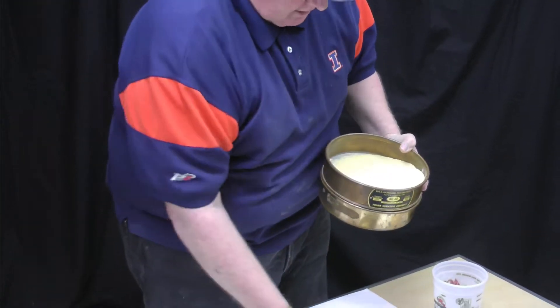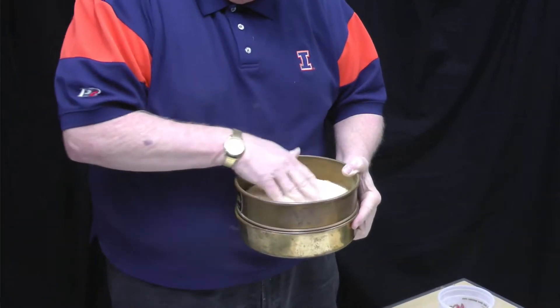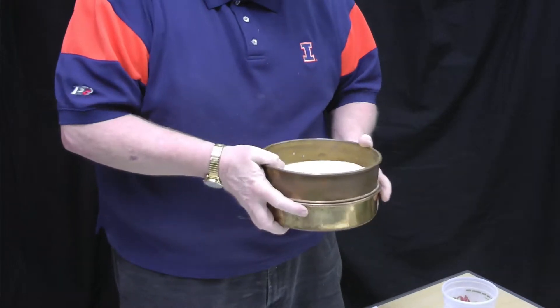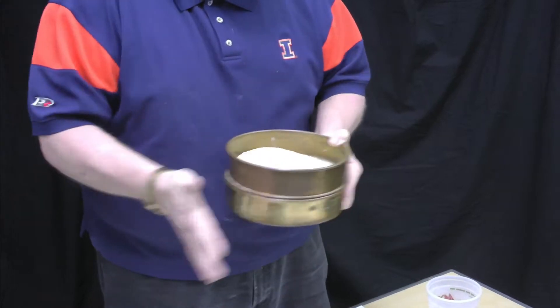We continue shaking the fourth screen. This is a much finer screen — this is a number 30 screen. You really have to work it and try to make sure it drives the flour through so it doesn't get hung up on the grain particles. Some people even bang it on the table to try to get it separated.